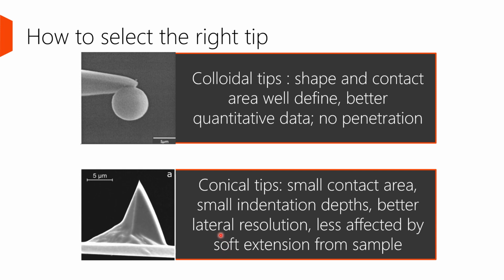Sometimes it will have a smaller indentation depth, but on the contrary, because it has a smaller tip, it will provide better lateral resolution, and it is less affected by the soft extension from the sample if we are doing experiments on the cells.